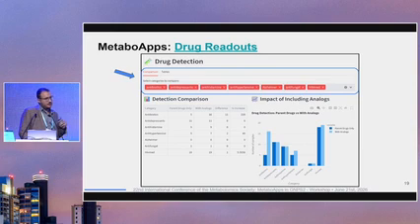And for many of those data sets and many of the works being done using these tools, at least for now, this can give you many hints on the type of data you have, especially depending on the matrix you have.